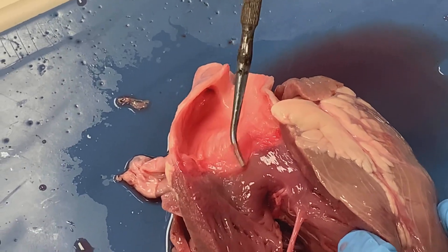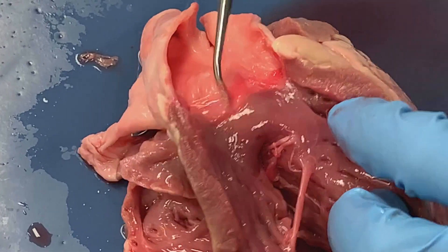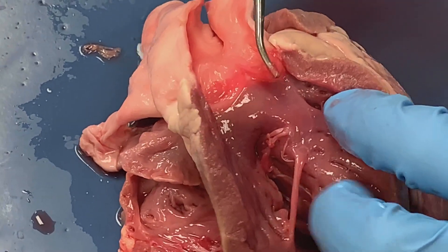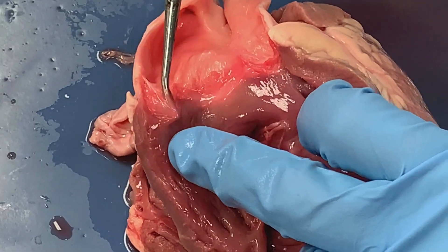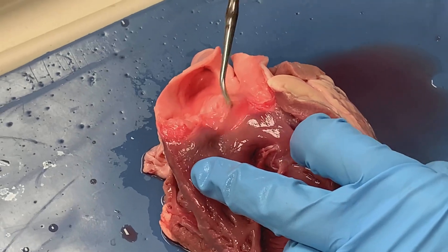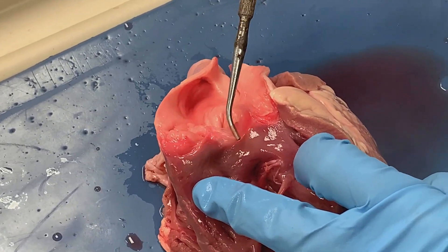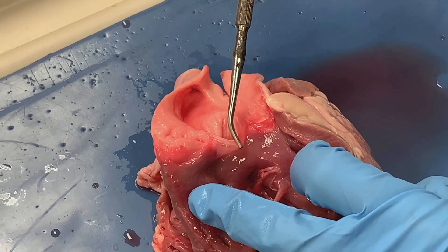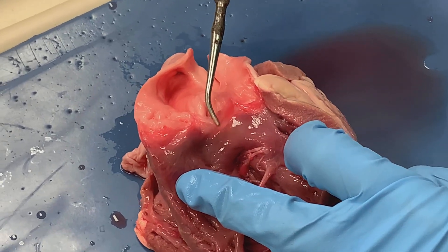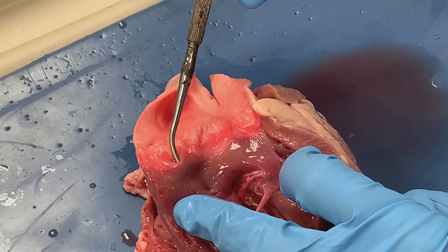Here you can see a pouch-like structure, or a pocket-like structure. There are actually three leaflets or three pockets that go together forming this valve, and we call this valve the pulmonic semilunar valve, or sometimes you might hear it referred to simply as the pulmonic valve.